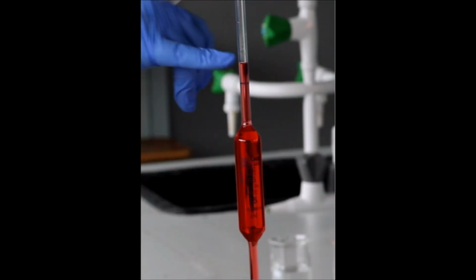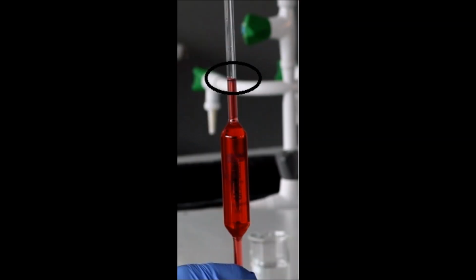I've paused the video and zoomed in at this point to show you how I've drawn the liquid about 2 centimeters above the calibration mark. I can depress the button on the filler and allow my solution to go down to the calibration mark. I've paused the video once again to show how the base of my liquid meniscus is just sitting on the calibration mark of my pipette.